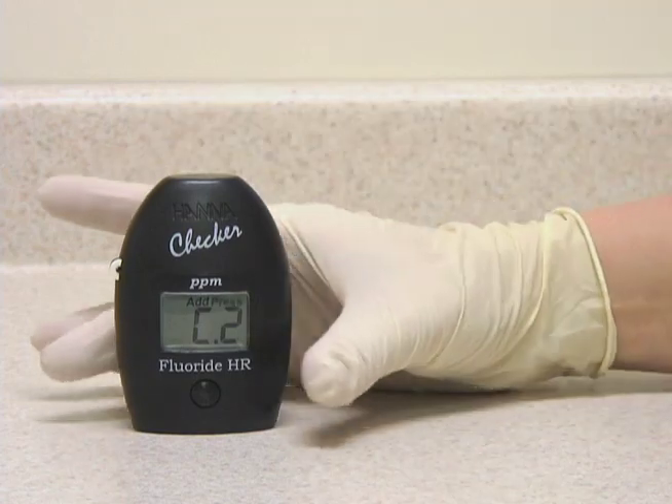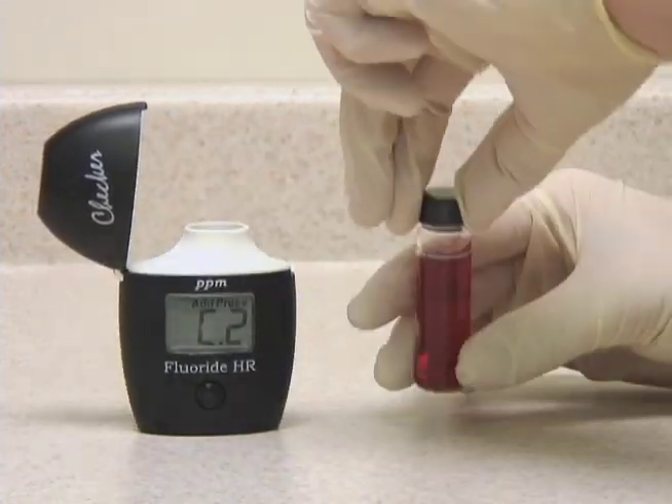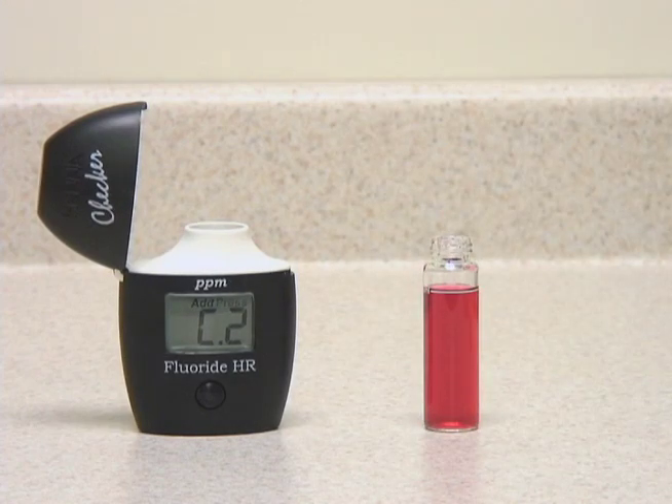Now that the meter displays C2, we're ready to add our sample. We're going to take the other included syringe and add exactly one milliliter of our sample.